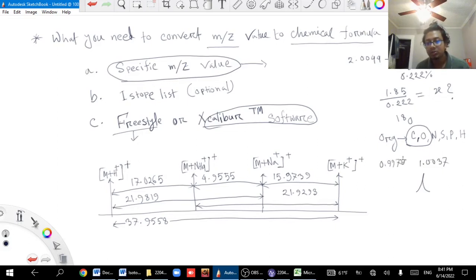So the nitrogen peak is 0.9970, which is very close to that, and sometimes this peak is attached to that peak because of the resolution. If you use low resolution, like 21730, this resolution can merge that nitrogen peak here.